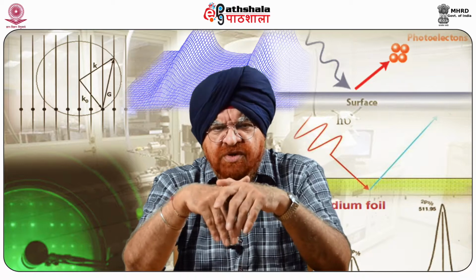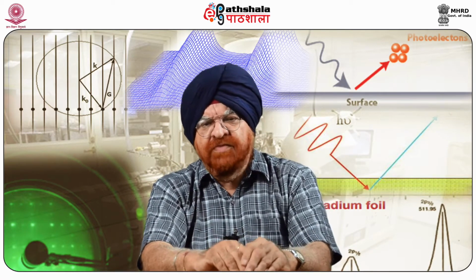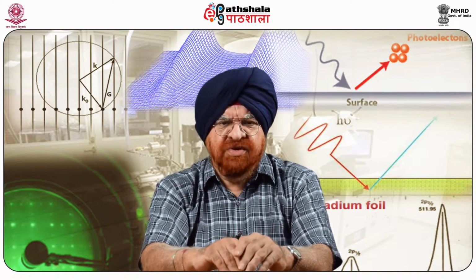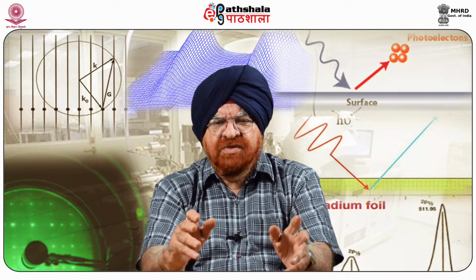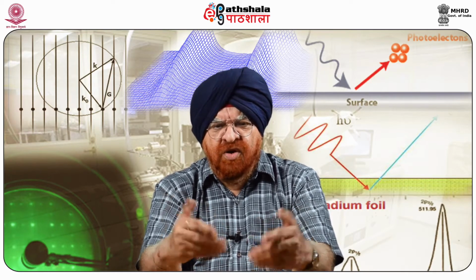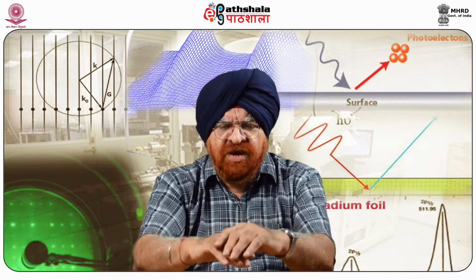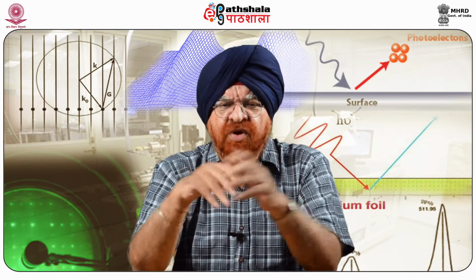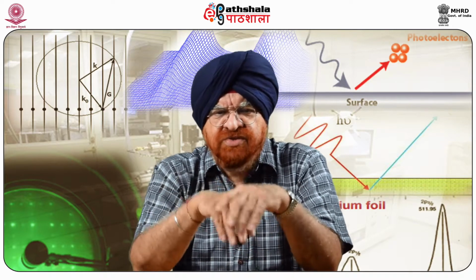Therefore, students, after having explained in detail about CFM and the data analysis that we can probably carry out with this, let's now summarize the results, and I'm sure you would have learnt a lot from this module. Interaction between chemical functionalities defines outcomes of the vast majority of important events in chemistry, biology, and material science.